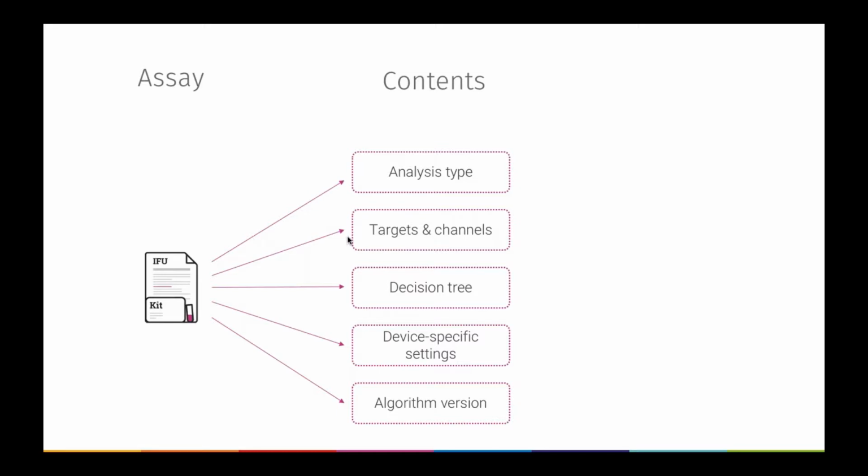It has a decision tree, maybe for a multiplex test. A certain result in the ROX channel indicates that another result indicates something else. So we look at what is the logic behind the assay. There are some device-specific settings.